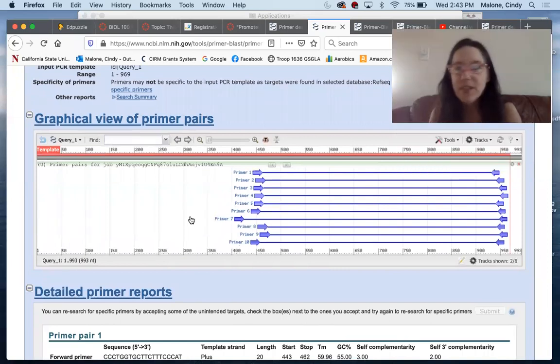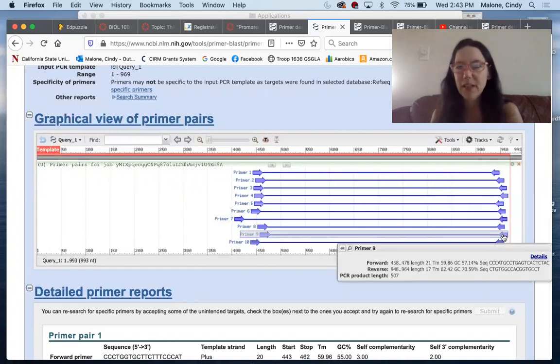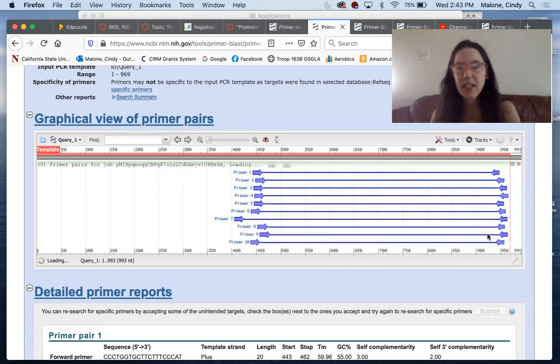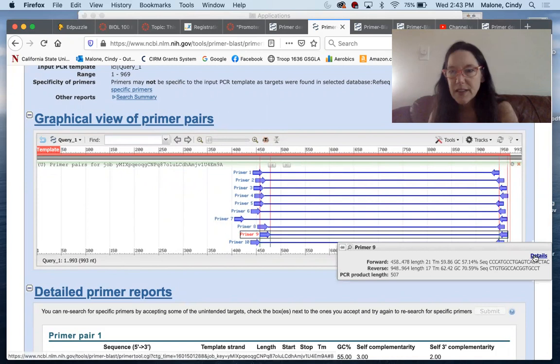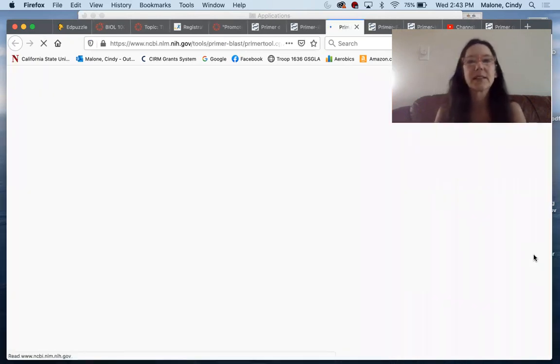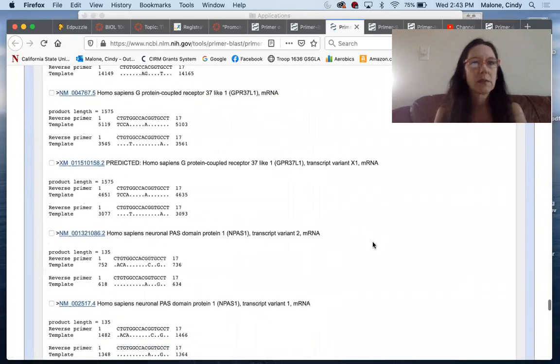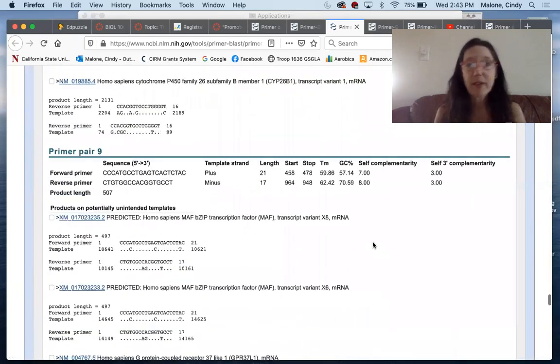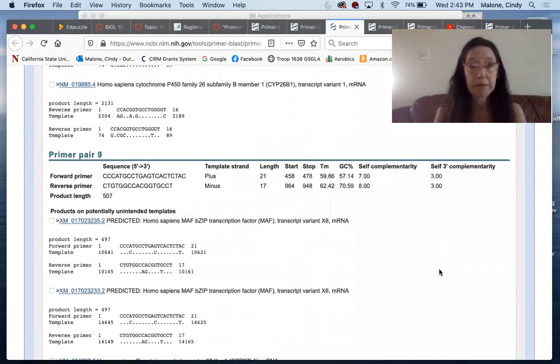If we look, what was the other guy we liked? We're looking for the guys closest. That guy's close. He's farther. He's farther. I think he's a little closer. Let's just go for him, right? Why not? Let's click him. Oops. There we go. Hit details. Gonna open us another. Hello. Uh-oh. Where'd he go? Primer pair 9. Is that the pair we wanted? Yeah.